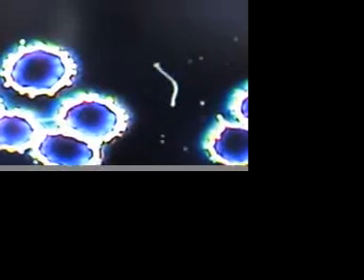This guy now, if you watch him, it sure looks like he's going somewhere rather than just floating around in the intercellular medium.